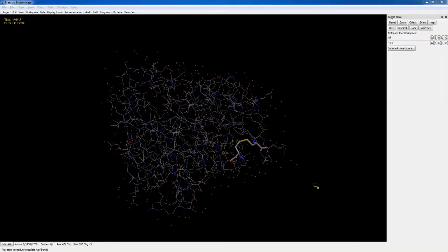Stabilization of native folded protein conformations is a frequent goal in projects that deal with affinity optimization, enzyme design, protein construct design, and reducing the size of functional proteins. One way to stabilize a protein is through the introduction of disulfide bonds.